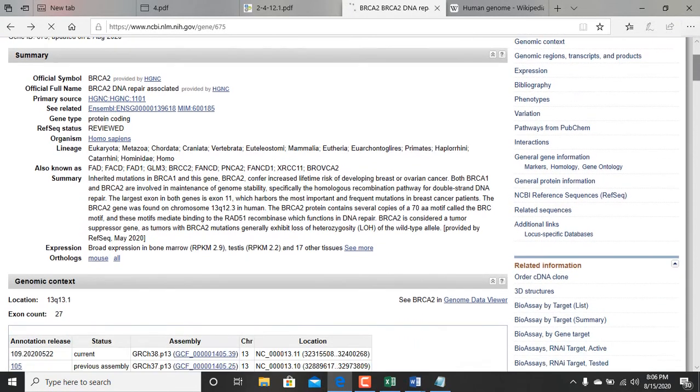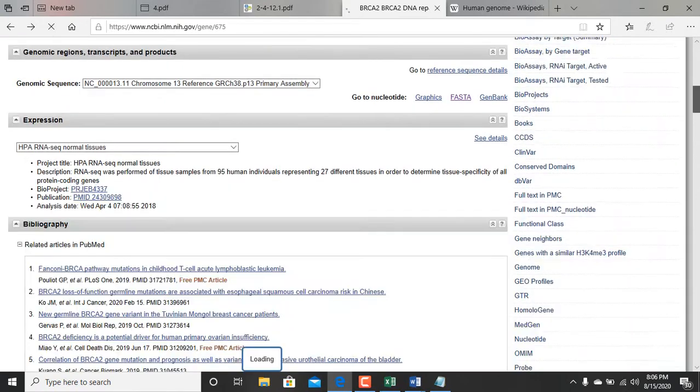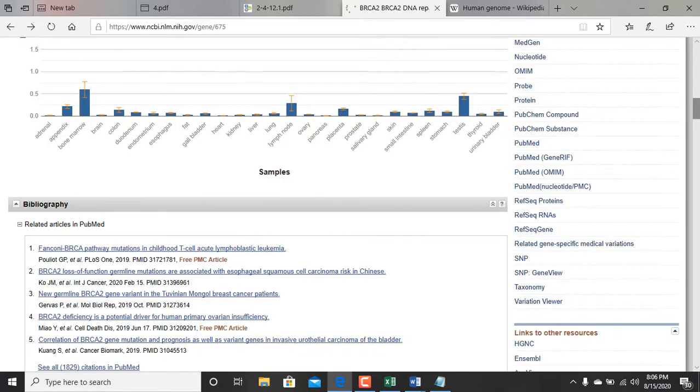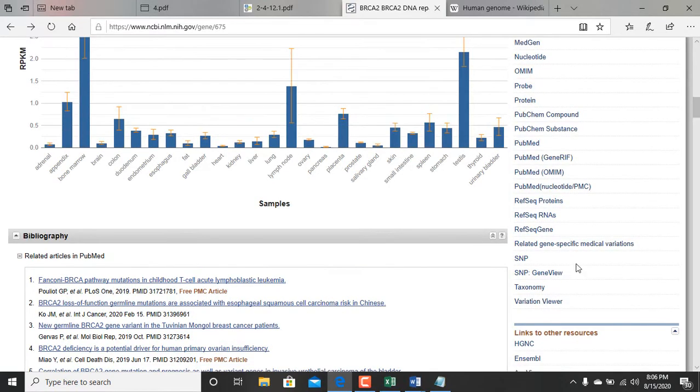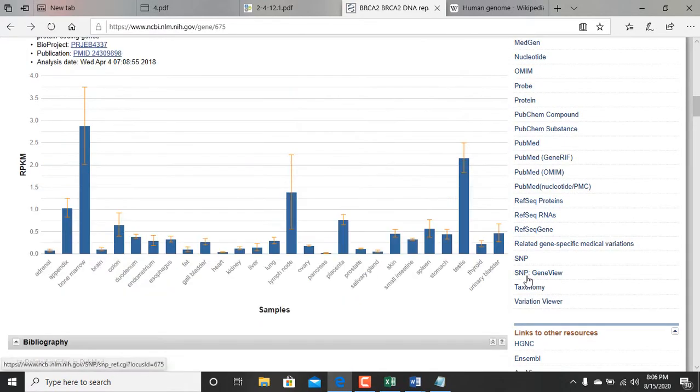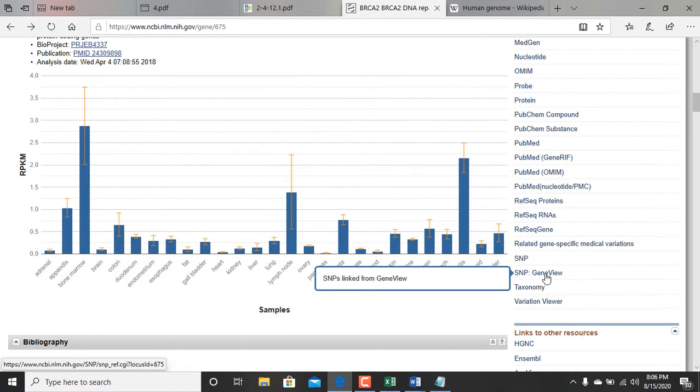From this point I can actually find the SNP. SNP gene viewer, I clicked on that.